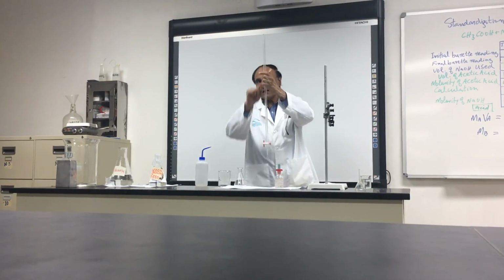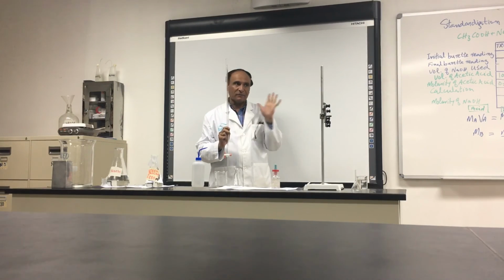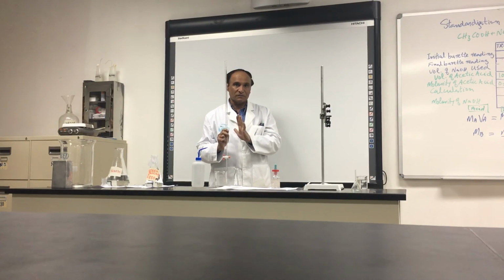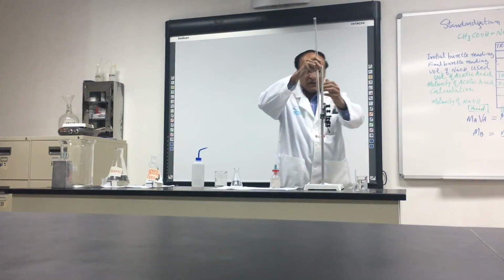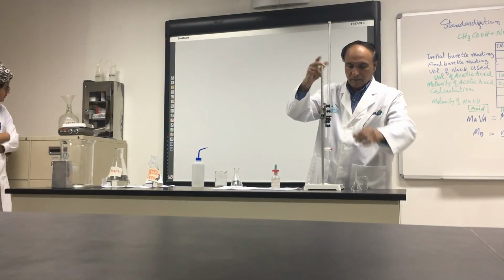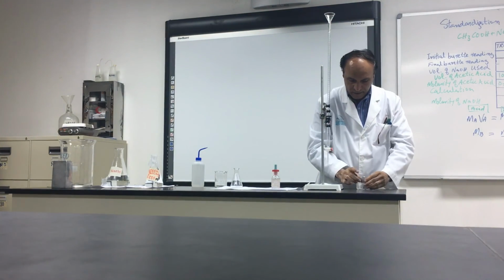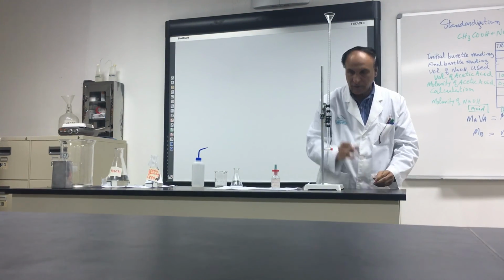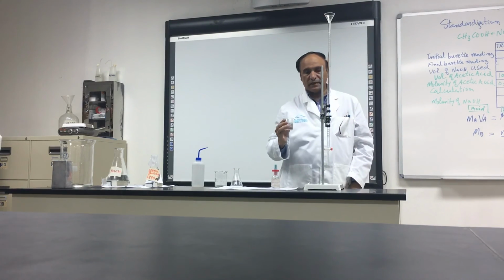But still there is some water inside, some drops of water. We don't want any drop of water because it will dilute the solution. So what we do, close it, fix it over here, put the funnel and put some sodium hydroxide in that, a little amount of the sodium hydroxide.